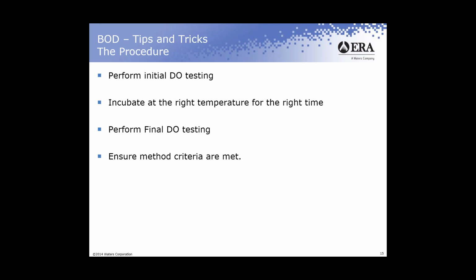Also, make sure, especially if you're running your DMRQA, it's a 5-day test. Allow yourself enough time for that 5-day incubation. Also, if your test happens to go wrong, something's not right in that, make sure you're leaving enough time to do the test a second time. So don't wait till right at the end of your PT test to start your sample. It doesn't allow any time for anything to go wrong.